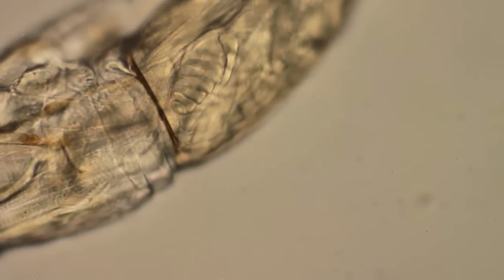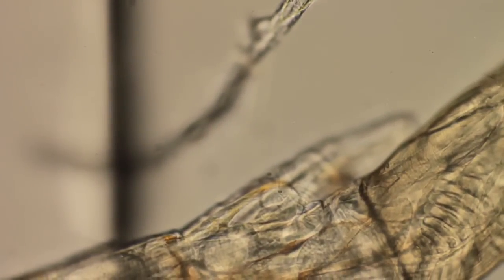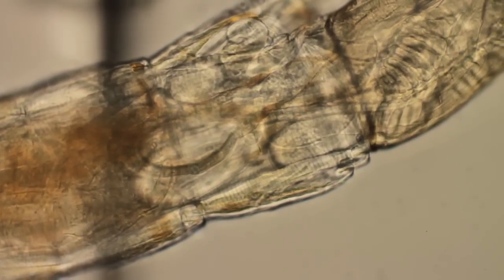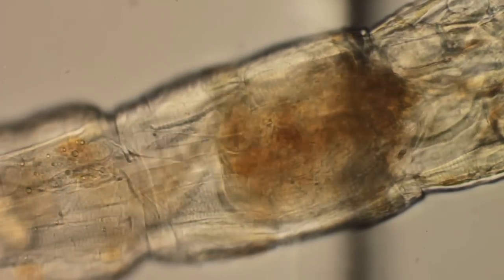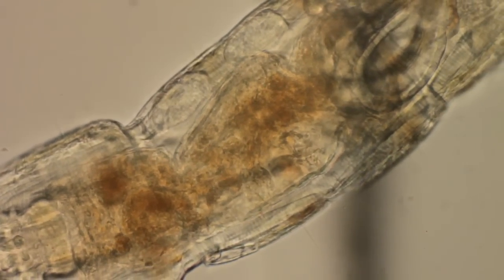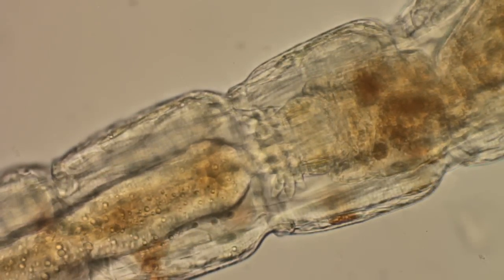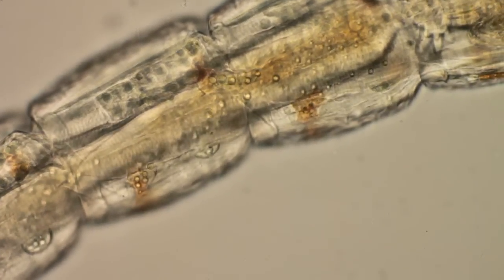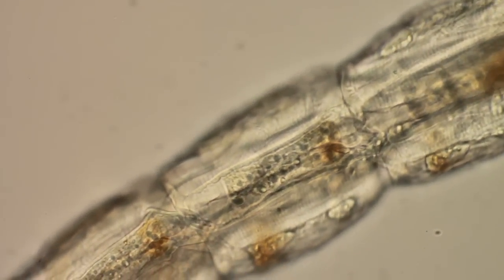Now we're going to look at him at 20X. You can see a lot of detail. The things with the diagonal lines in them are muscle fibers that go along the length of the body. It seems like all these insects, larvae, and bugs have muscle fibers like the copepods — the cyclops do too; their muscle fibers have crosshatch lines down the length of them. There's something interesting going on in his gut — this little thing with what looks like udders on it. Those might be something like little appendixes or something. I wish I knew more about it.